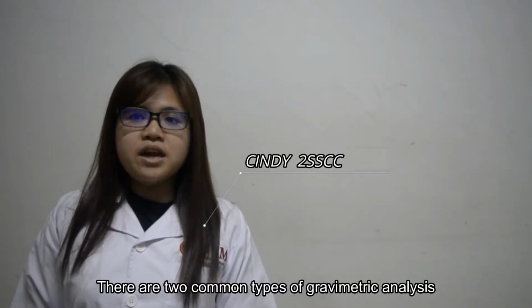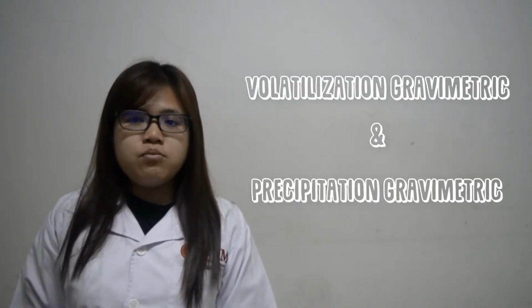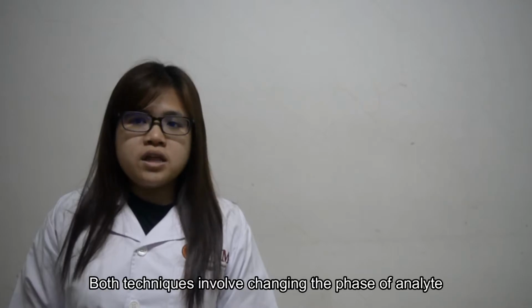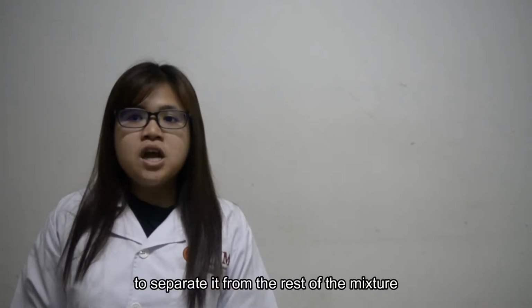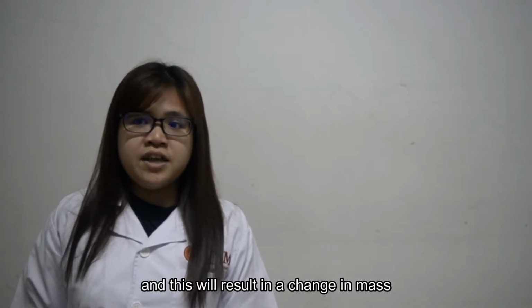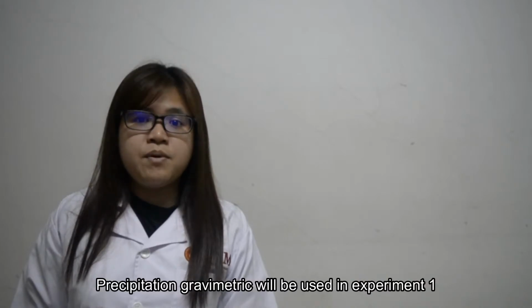There are 2 common types of gravimetric analysis, which are volatilization gravimetry and precipitation gravimetry. Both techniques involve changing the phase of the analyte to separate it from the rest of a mixture, and this will result in a change in mass. Precipitation gravimetry will be used in experiment 1.